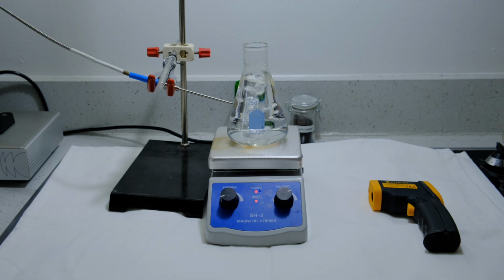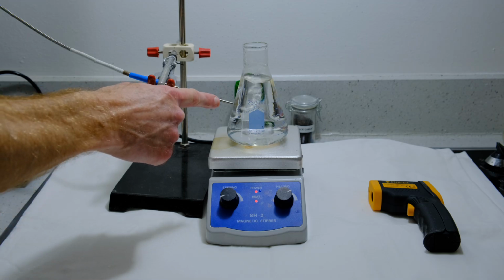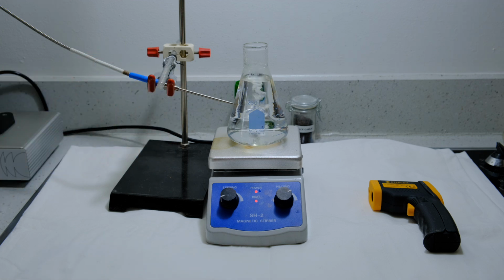Okay, so let's try this again, but now note that we have a reflection probe set up to monitor the color of this in real time as the nanoparticles form. So let's start by adding in a half ml of our gold concentrate there. Looks good. Then we'll also add in a half ml of our citrate, and watch how fast this happens.